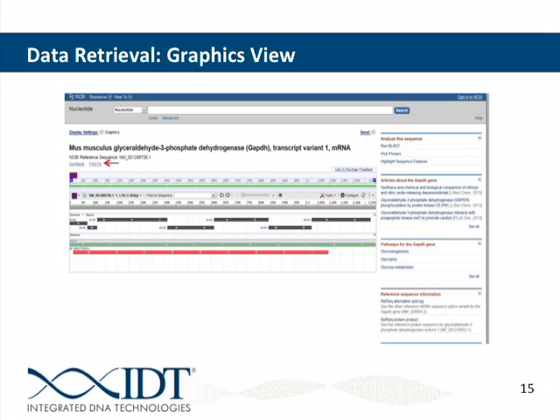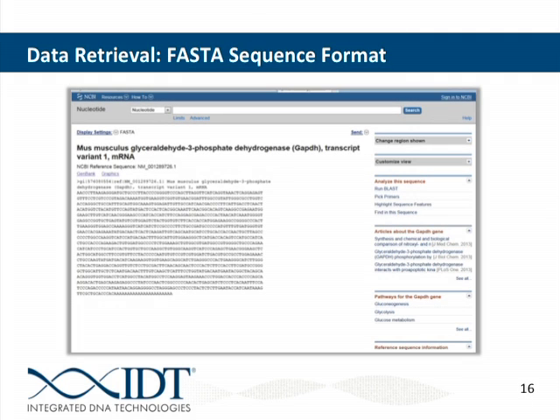We can also go to see a graphic representation, again, of our gene organization with the introns and exons. And then here's that FASTA sequence. So this FASTA sequence is highly versatile. It's easy to just copy and paste and put into PrimerQuest, for example.